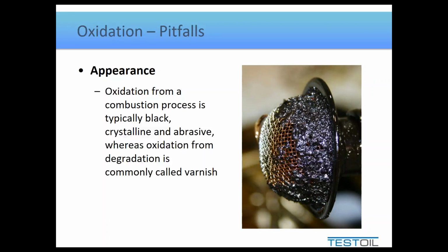It's a bit gritty. So if you notice any deposits building up and you wouldn't describe them as being slimy or slippery, but you would describe them as being a bit gritty, chances are you're looking at deposits from an oxidation reaction. And the worse your oxidation is, or the longer you allow it to continue, the greater the likelihood is that it will form such deposits.